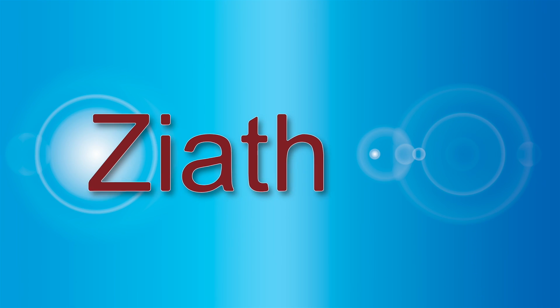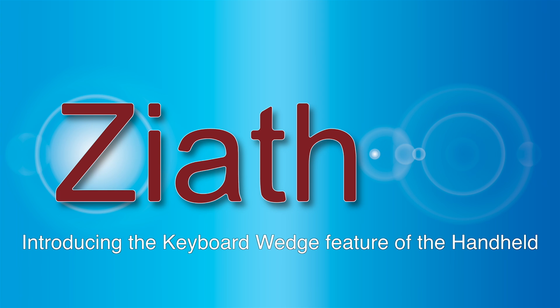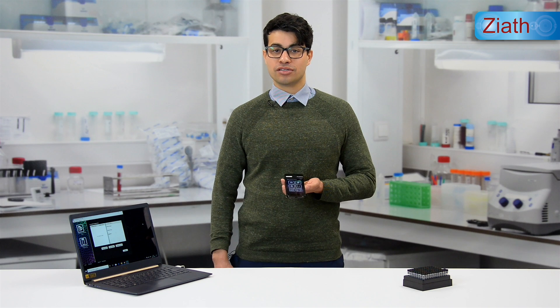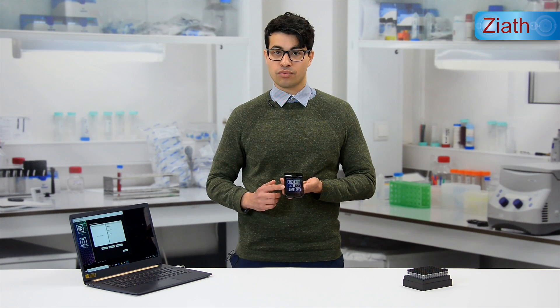In this short series of videos, our product support engineer Avash Anderson goes through each of the features of the Ziath handheld device. Welcome to the Ziath Applications Laboratory here in Cambridge. My name is Avash Anderson and I'm going to explain to you how the Ziath handheld device works.